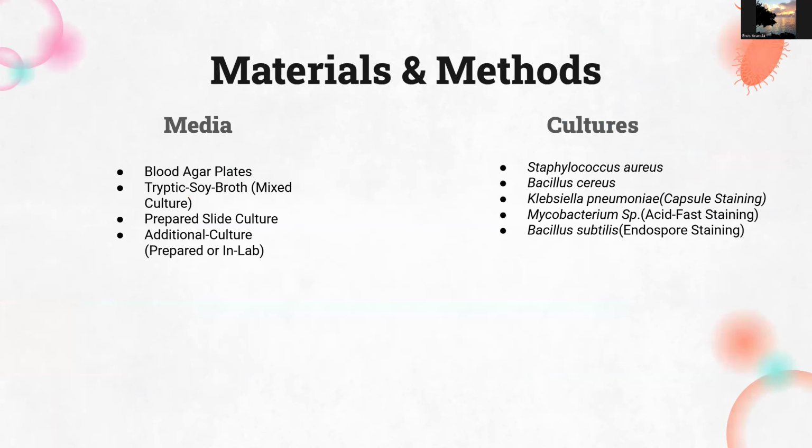So, materials and methods. Obviously media, we have to use different types of plates in order to get our cultures and be able to place them onto the slides. And our cultures themselves, we used Staphylococcus aureus, Bacillus cereus, Klebsiella pneumoniae, Mycobacterium sp, and Bacillus subtilis.